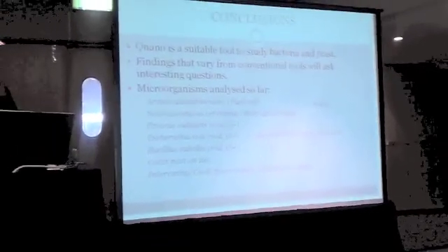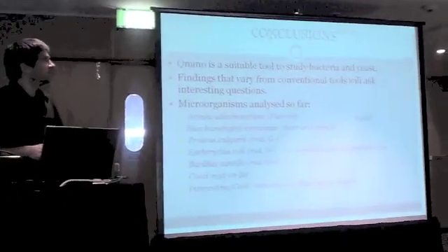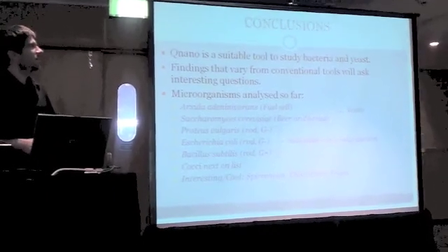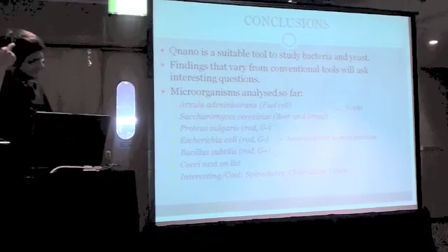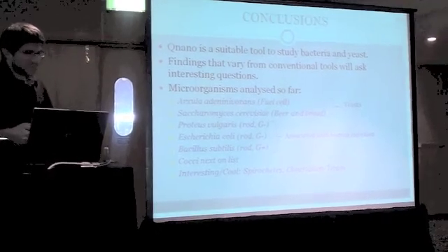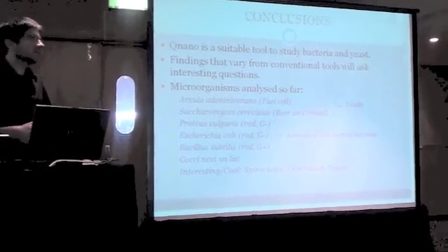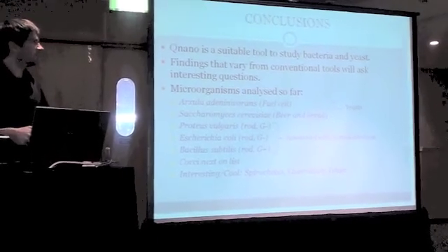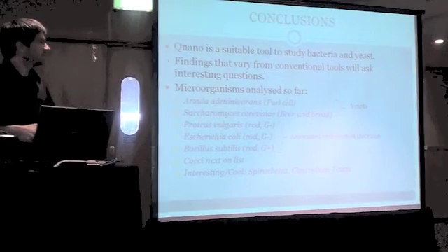This is actually all I wanted to show you today. The conclusion of this work was that the qNano is indeed suitable for the study of bacteria and yeast. Sometimes you might be puzzled or disappointed by the findings, but if we have enough time, we'll investigate these puzzling results, and I'm quite confident there's something interesting there.